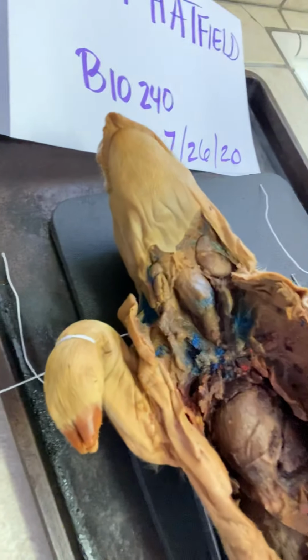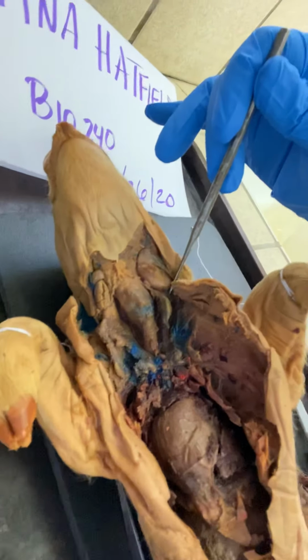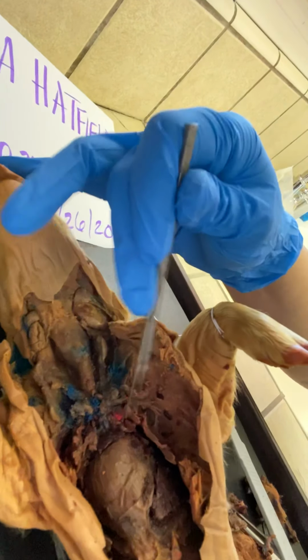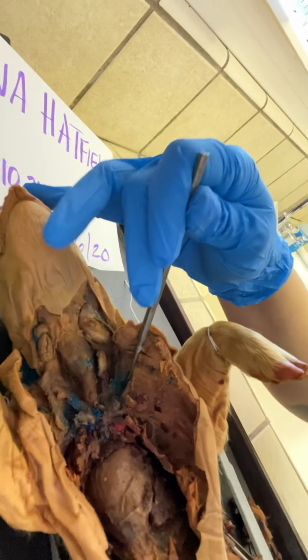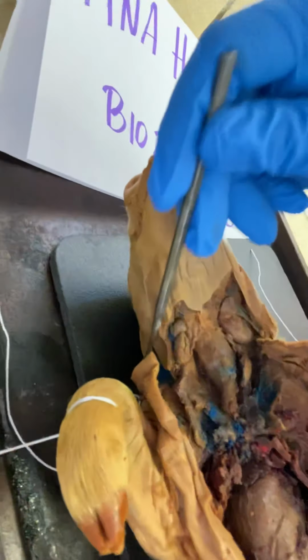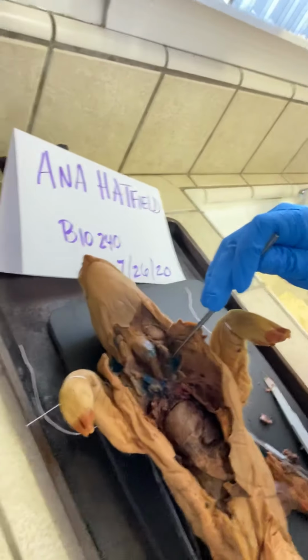Okay, so I don't know if you can see the pig. Okay, so here is, of course, the trachea, the thyroid area. Here's my heart, and my veins have exploded. So when I cut into it, as you can see, somewhere over here, it was already leaking, so it was a little bit harder to see what I was looking at.